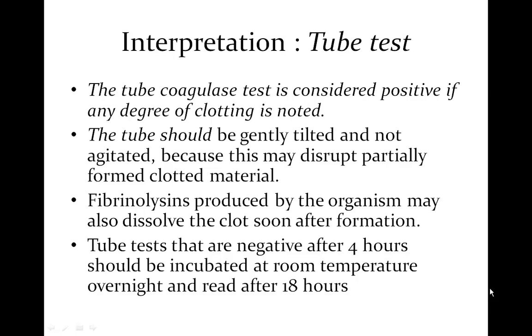The tube tests that are negative after 4 hours should be incubated at room temperature overnight and read after 18 hours. Sometimes fibrinolysin produced by the organism may dissolve the clot soon after its formation. That's why we read the test 2 times, one at 4 hours and second at 18 hours.